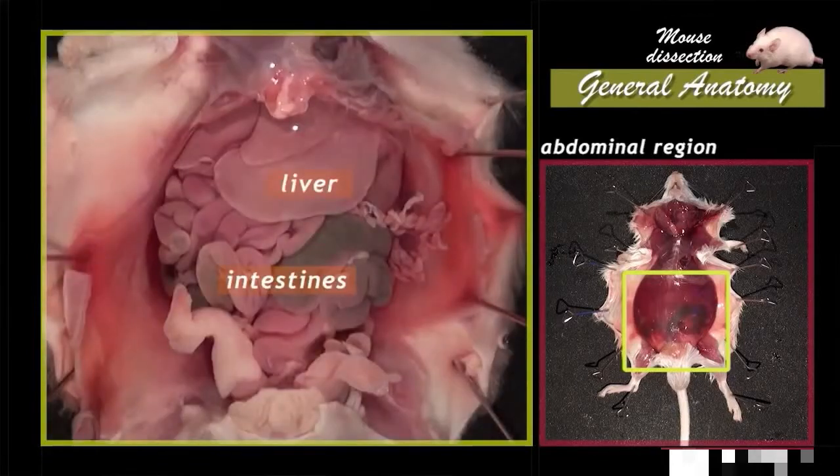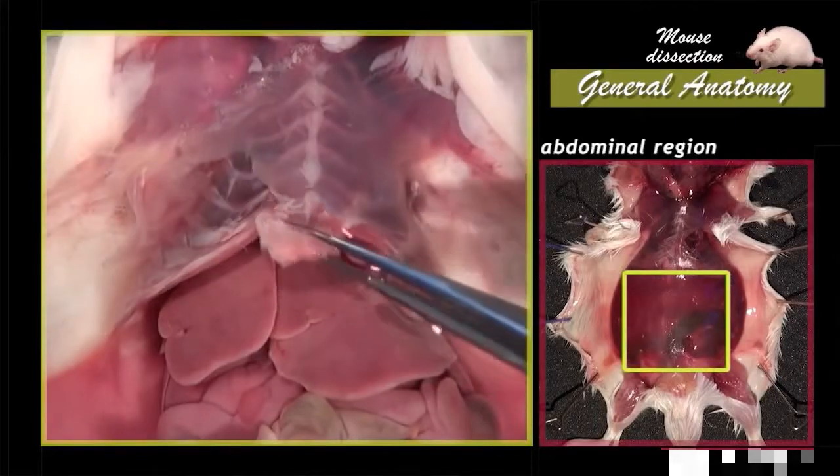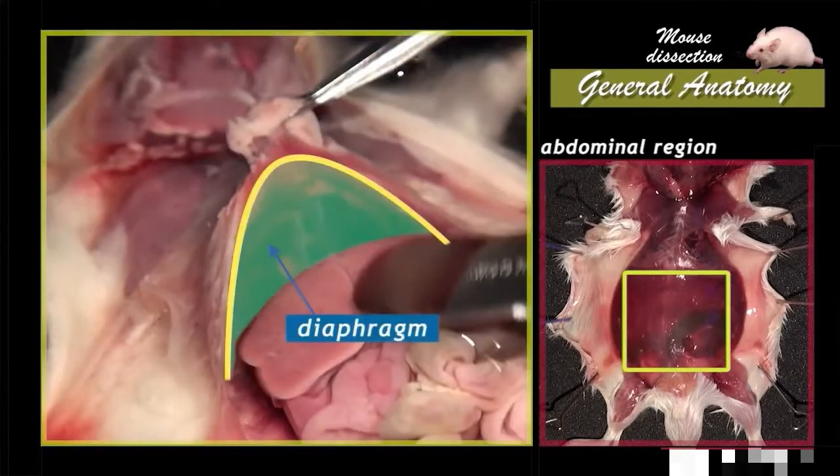The liver and a part of the intestines are now visible. In its upper part, the abdominal cavity is separated from the thoracic cavity by a very well-developed muscle, the diaphragm.